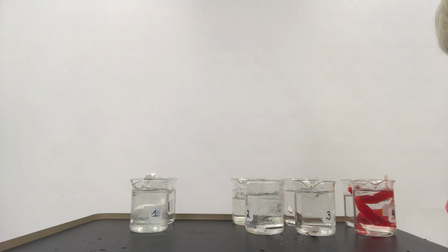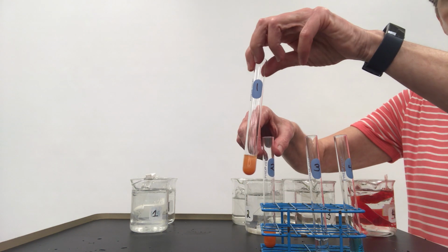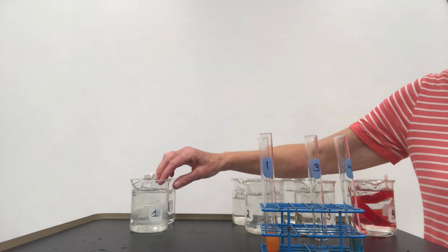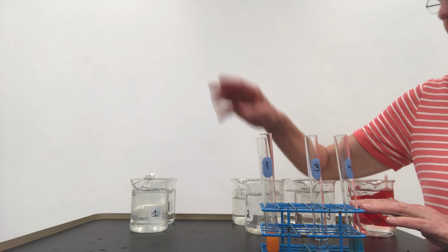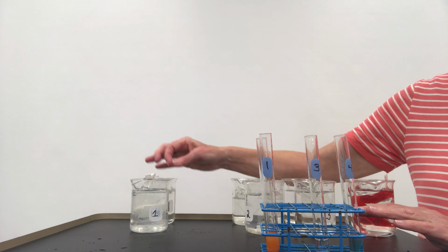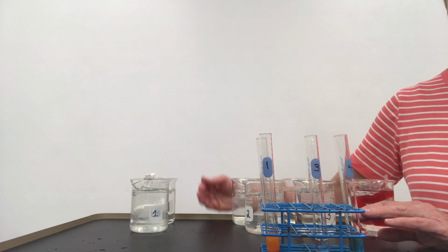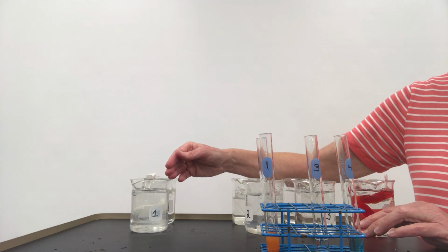So when we did that experiment, we saw that in the beaker and in the sac, they both indicate that there is sugar present. Now, we started out with no sugar in the beaker fluid, but there's sugar now at the end of the lab, which means that the sugar was able to diffuse out of the sac into the beaker. Diffusion is the movement from high to low concentration with no energy involved, and it is a non-biological movement. So when we talk about the sugar moving from high to low, we call it diffusion.